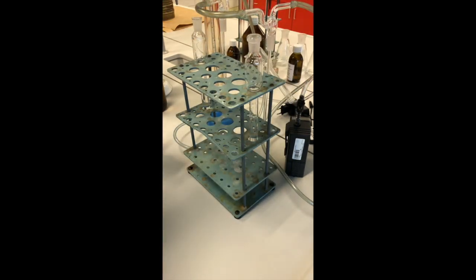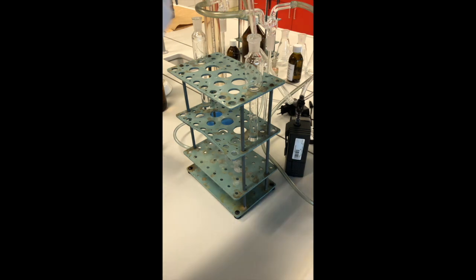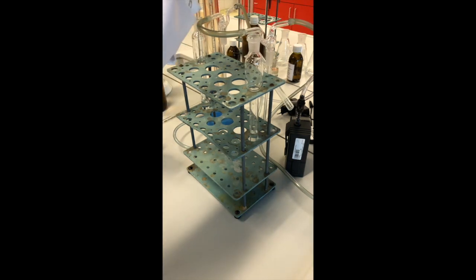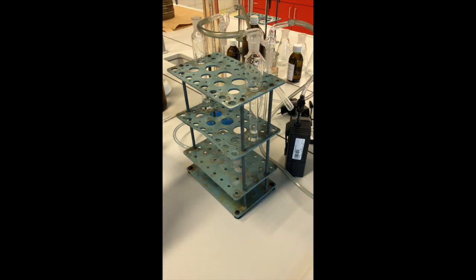We have 2 tubes. We take the pipette and take 5 cubic centimeters, and the same for the second. When you are right-handed, you should take the pipette in your right hand. When you are left-handed, you should use the left hand.